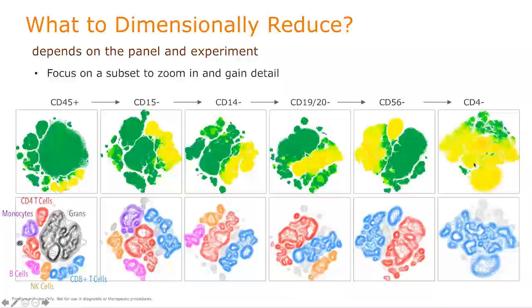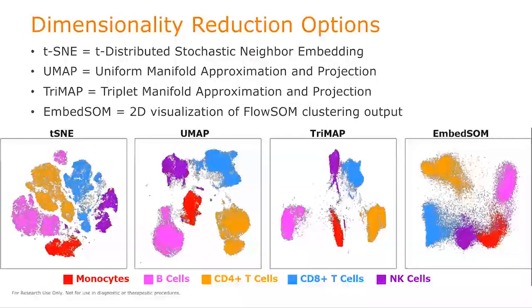So if my focus is I want to look at CD8s and look at memory and exhaustion in CD8s, then maybe I'm not going to do the dimensionality reduction or clustering at a higher level. I'm going to go right down to my lineage and then subset within that set of events with a clustering algorithm and display it with dimensionality reduction in this two-dimensional view.